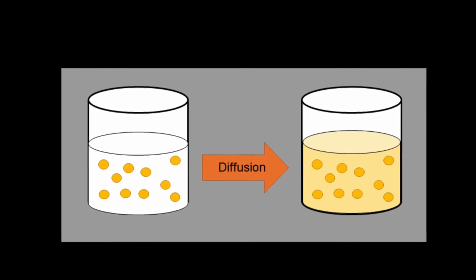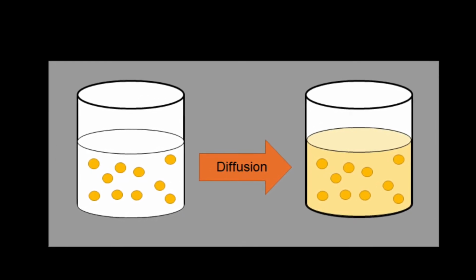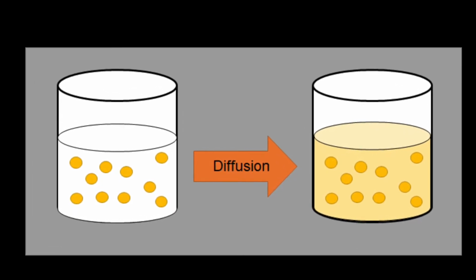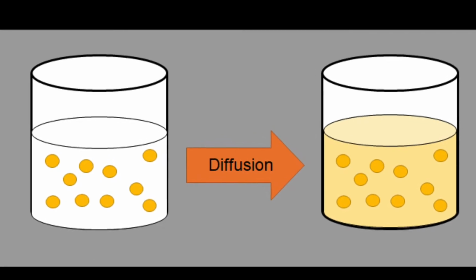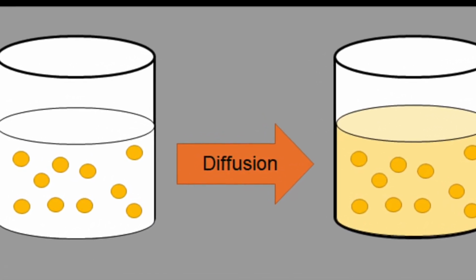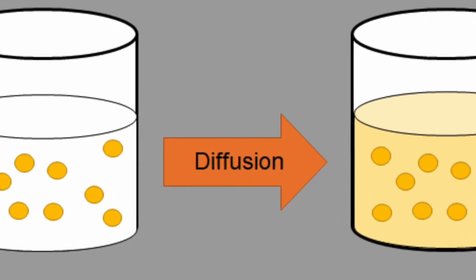Drug delivery is the process of administering a pharmaceutical compound to achieve a therapeutic effect. Controlled drug delivery systems administer a drug at a predetermined rate. It is imperative for the drug to be released at this rate to achieve maximum efficiency. By doing this experiment, we are able to mimic a drug entering the body and determine the optimal condition for drug delivery based on the Fickian diffusion mechanism.